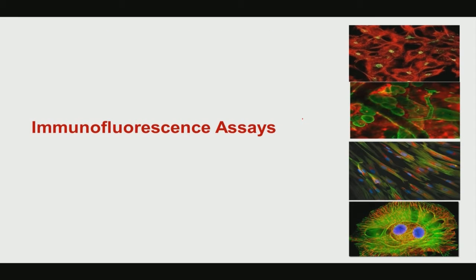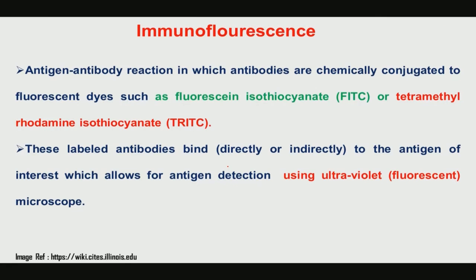Okay. Now, the next set of assays that I will briefly mention, not in as much detail as I have done for the earlier 5-6 assays, is called the immunofluorescence assay. I will just cover the basic principle of these things first.